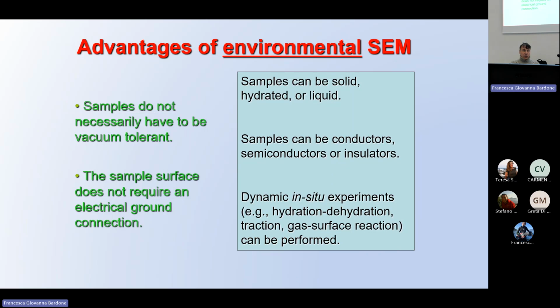The sample does not necessarily have to be vacuum tolerant, and the sample surface does not require any electrical conduction or treatment. You can do observation without any preparation and keep the water in the liquid state. Samples can be conductors, semiconductors, insulators, whatever type.